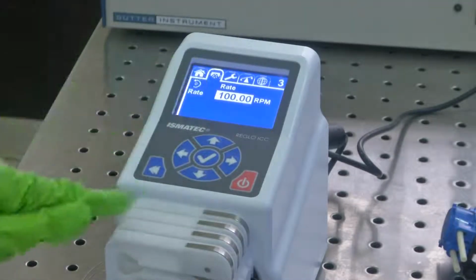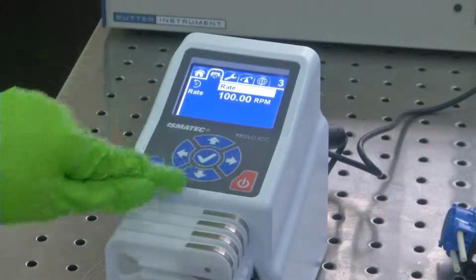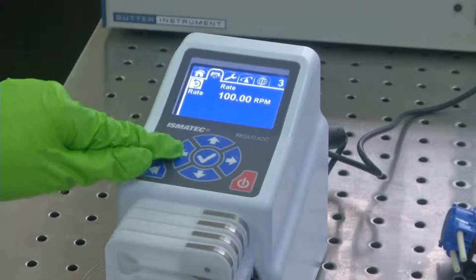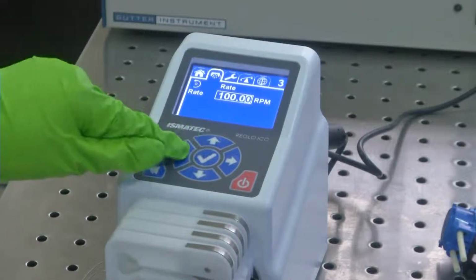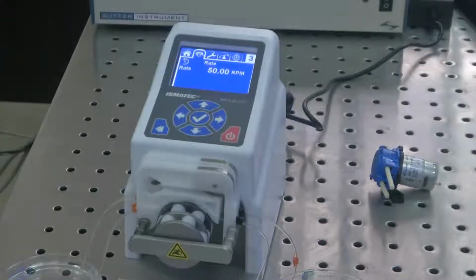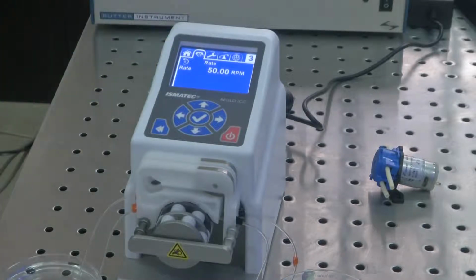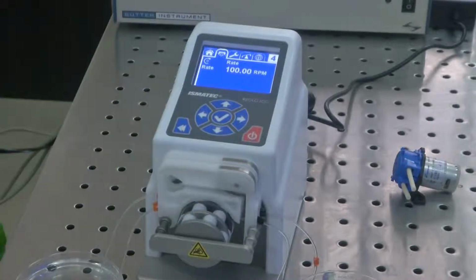Say I'd like to change the RPM. Now it is at 100 RPM, and then I'll reduce it. Like I showed, you could change the rotation. Now it is rotating in the anti-clockwise direction. And now from 100 RPM, say I reduce it to 50 RPM, 50 revolutions per minute, and the direction is anti-clockwise. So let us see what the fourth channel is. The fourth is set at 100 RPM and it is set to the clockwise direction.